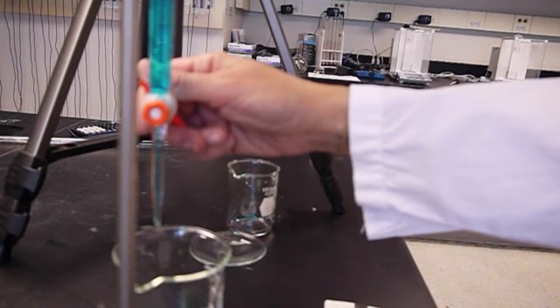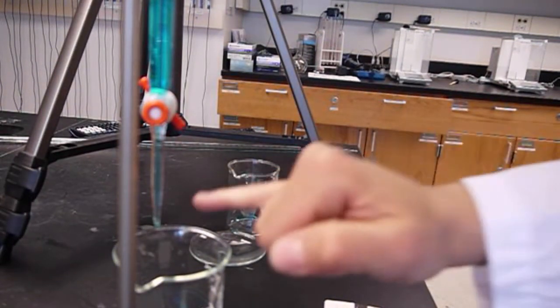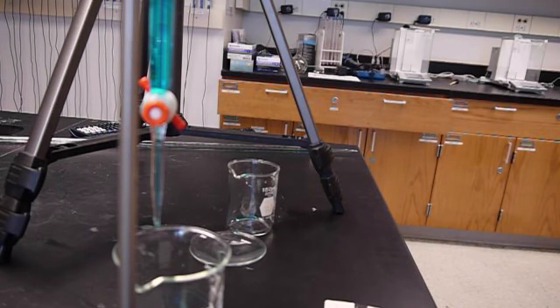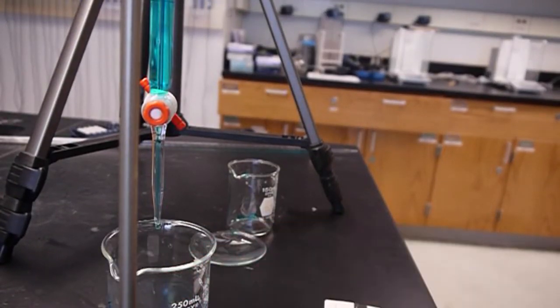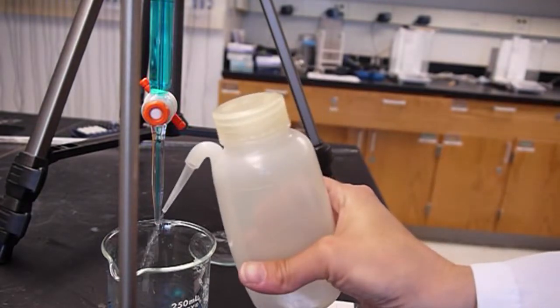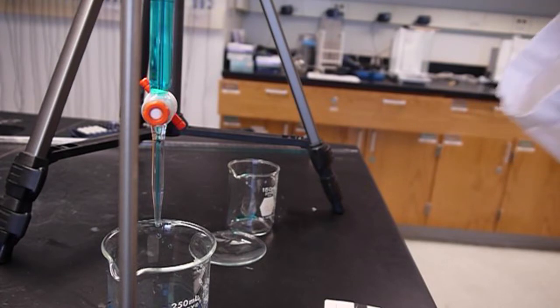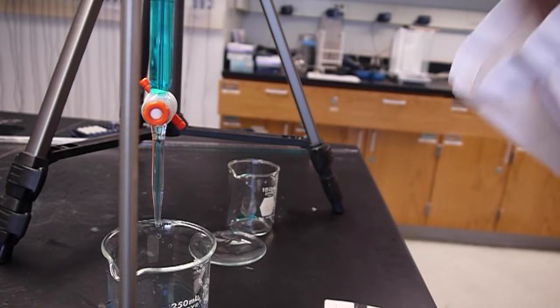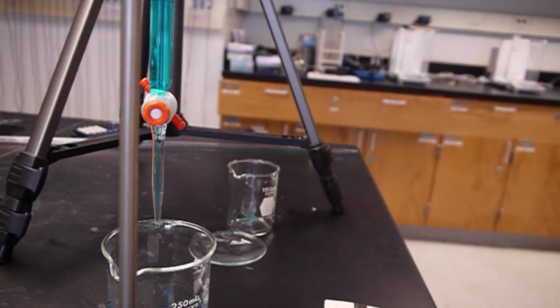There's also a nice little trick where if you stop with a little bit of a bubble at the end of the burette tip, you see that? Just a smidge of a bubble right there. You can then use your wash bottle, add some water, spray that into your beaker where you're doing a titration. You've added essentially half a drop of solution. When you get really close to an endpoint of a titration, that's a really nice tip to make sure you get the exact endpoint. But you also want to make sure that you're rinsing down your beaker as well when you do that.